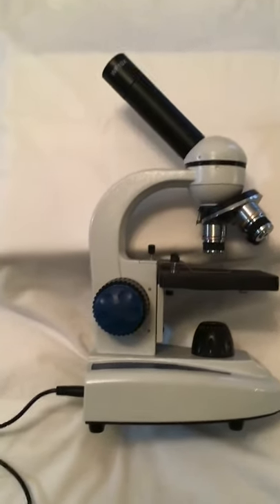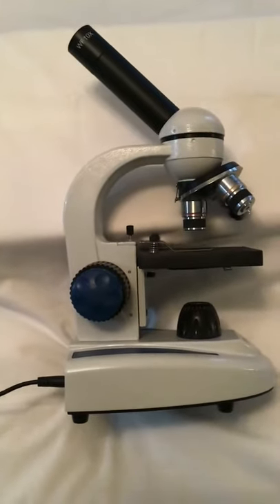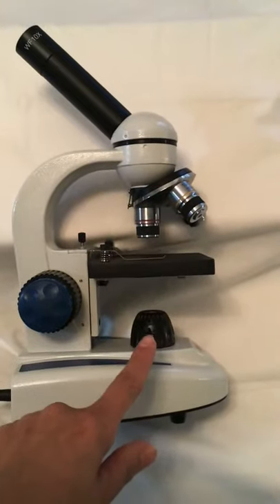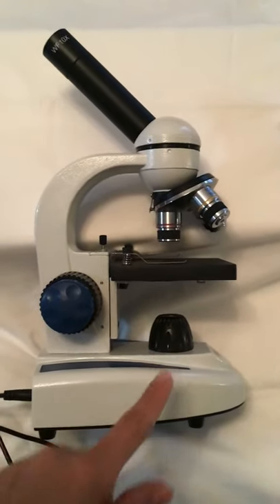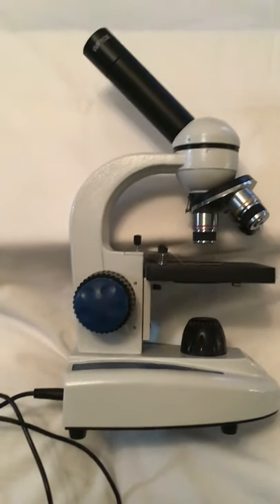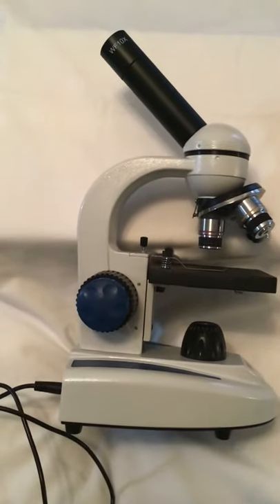This is a pretty basic model. It is electrical. There are some microscopes that have a mirror as their light source, but this one actually has a lamp. So we're going to go from top to bottom and work our way down to setting up a slide for viewing.